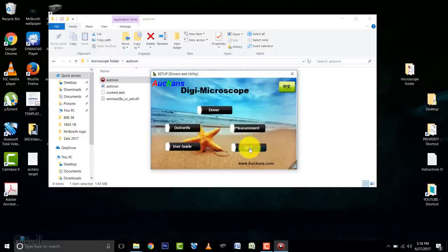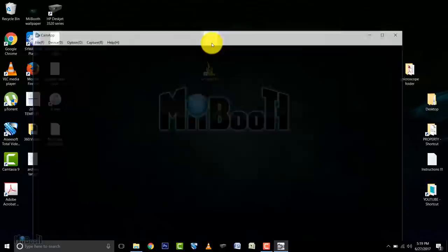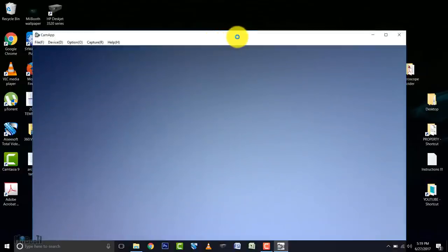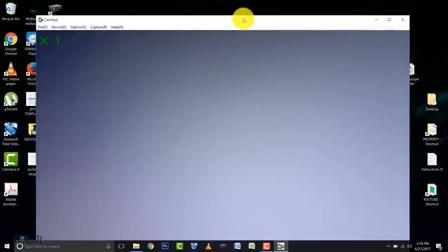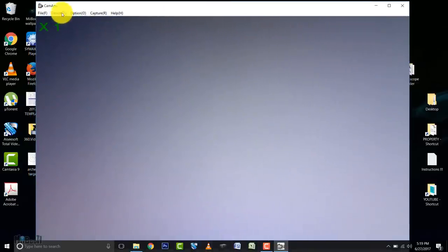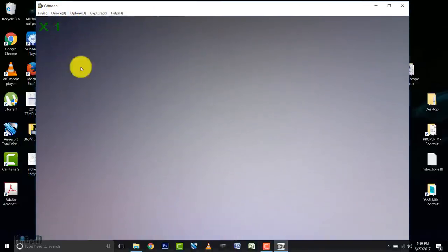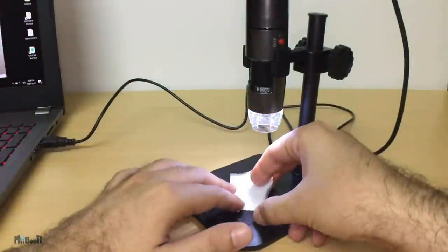Now we are going to fire it up. The first app that we installed is this. The name is CamApp. Launch it, and straight away you can see the camera is working. If you see your webcam instead, simply go to device and select the USB 2.0 PC camera.